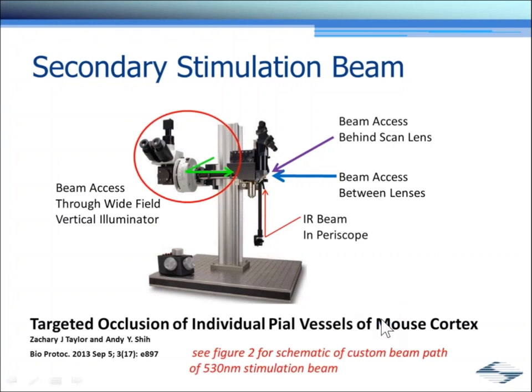And indeed, here's a group and a paper that publishes a very nice schematic of how they're bringing in a stimulation beam through the wide field path on our system.